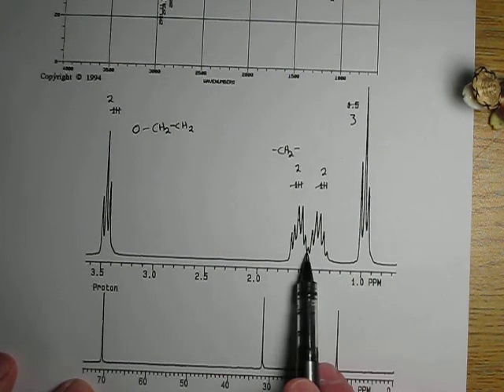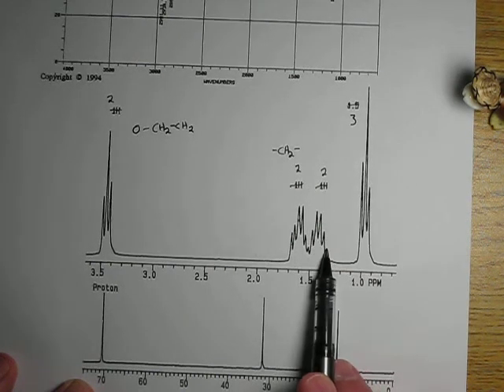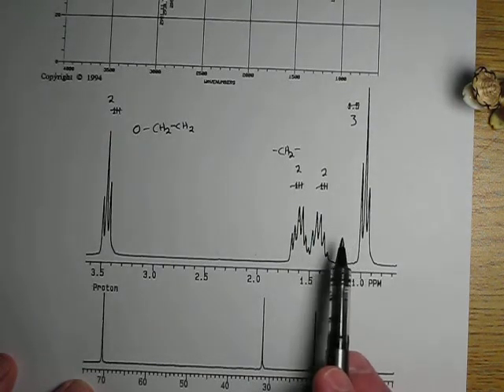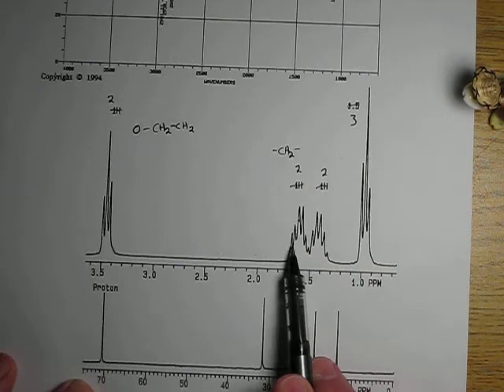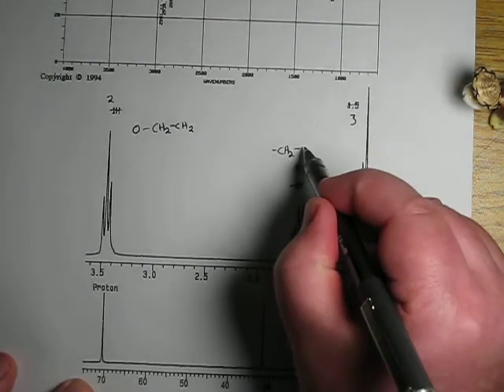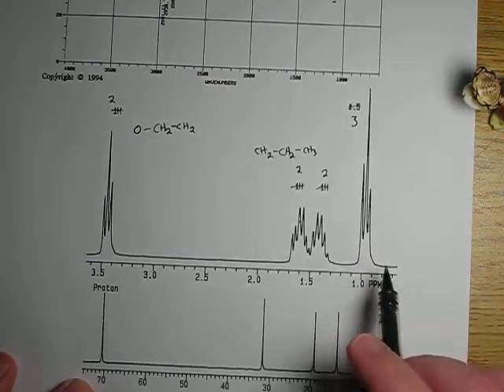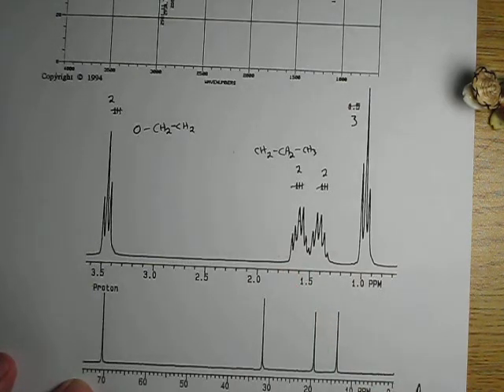Note, if this guy belongs to this one over here, that's 1, 2, 3, 4, 5, 6. That would be a CH3 and a CH2. So the good news is we don't have to worry about this, because whether this one belongs to here or to here, either we have 5 peaks and 6 peaks, or 6 peaks and 5 peaks. They're both CH2s. Either way, that's telling us we have a CH3, CH2, CH2, or a CH2, CH2, CH2. Okay.